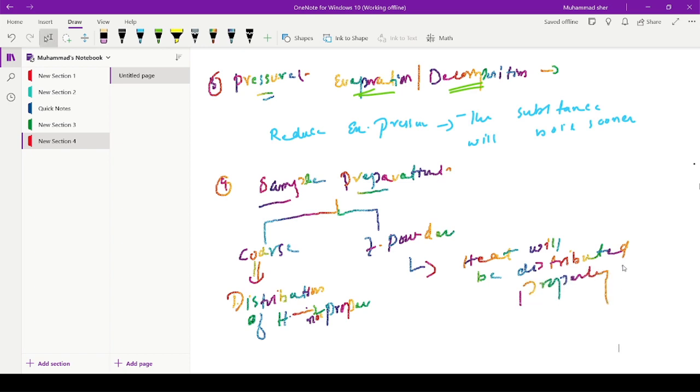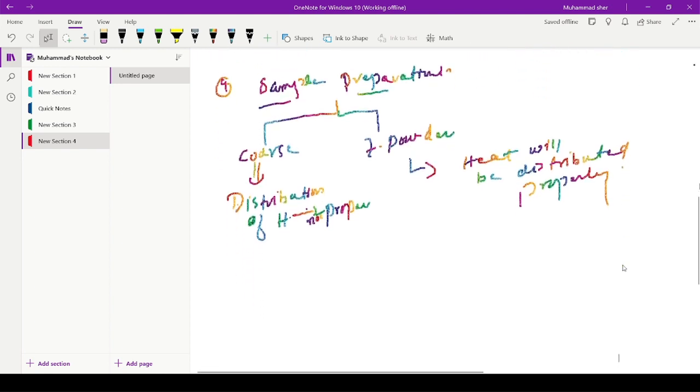So we will try to study our compound, or to make the TGA of our compound, in fine powder form, because in coarse mixture this may affect our final results.